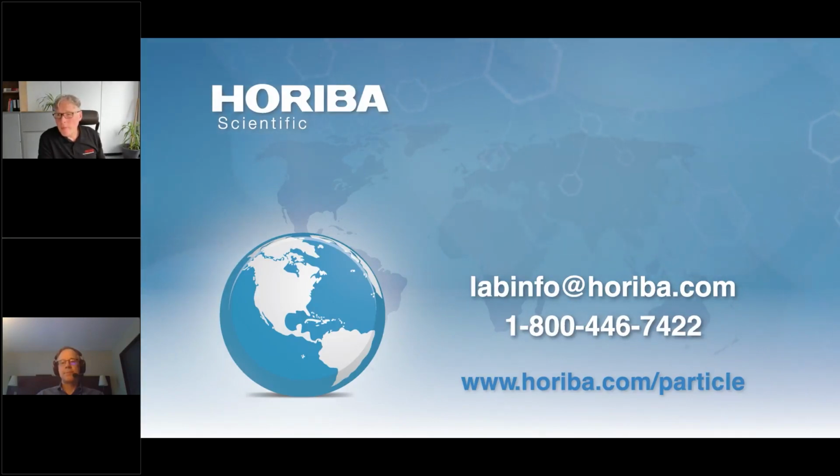Another question that came in is a little bit long, so I'm going to go ahead and read that. Do you think this technique can be applied in the characterization of inorganic microparticles, such as adjuvants? And then I'll read part 2 of that question. Adjuvants in a biopharmaceutical product. In this case, they have a product that's in suspension and has quite a large amount of particles contained. So do you think this technique can be applied in the characterization of inorganic microparticles in biopharmaceutical products?